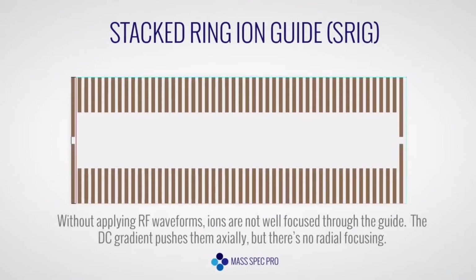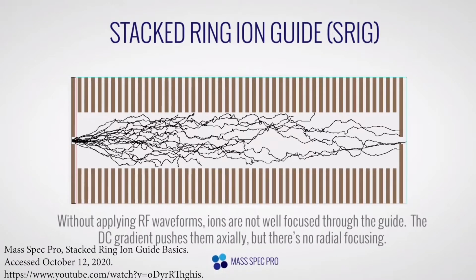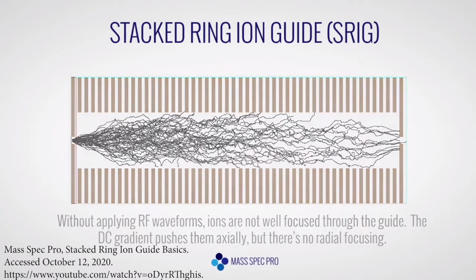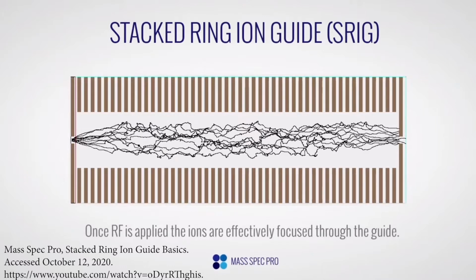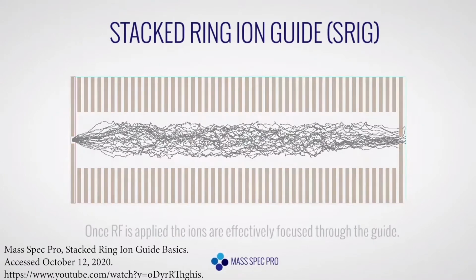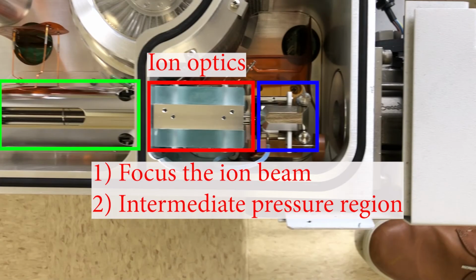And we're going to lose a lot of ions. So you can see a bunch of them just sort of hit the walls. They never make it through that other hole. They're never going to get to the mass analyzer. They're never going to get to the detector and be detected. So we lose a lot of signal here for no good reason. A nice ion optic will do this. You turn on this electric field and it focuses those ions. It keeps them on task. It gets them through that second hole and it pushes them nicely into the mass analyzer so that all those ions we worked hard to form in the ion source actually make it into the mass analyzer to be detected.